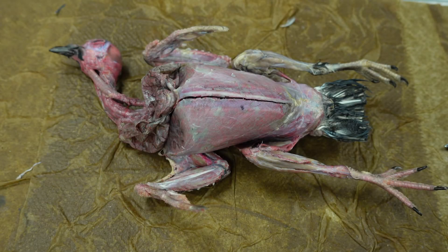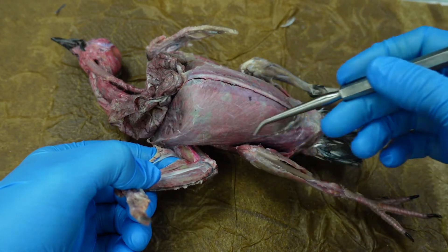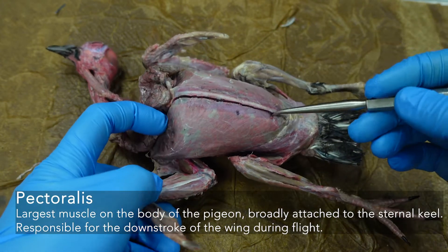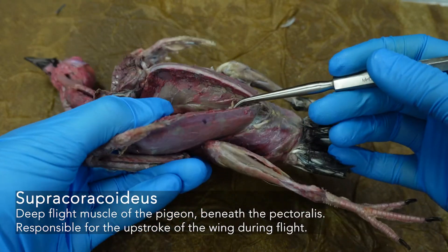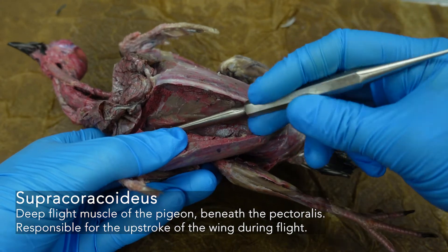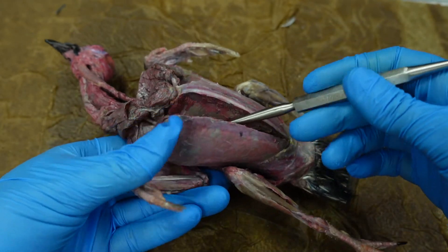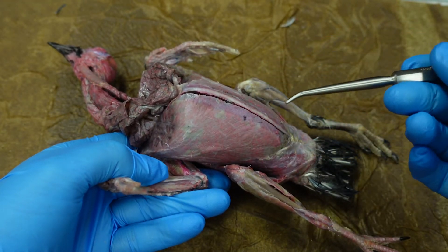Hey everyone, let's take a closer look at the muscles of the pigeon. The largest muscle on the pigeon's body is the pectoralis, and if you look underneath it, the supracoracoideus. The supracoracoideus is responsible for the upstroke when the pigeon lifts its wings, and the pectoralis is responsible for that powerful downstroke.